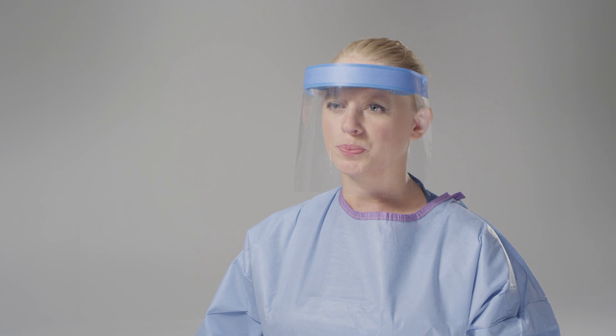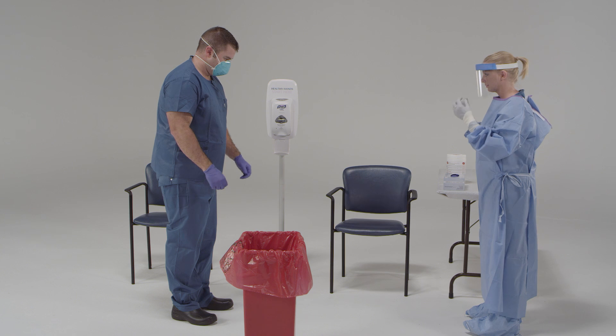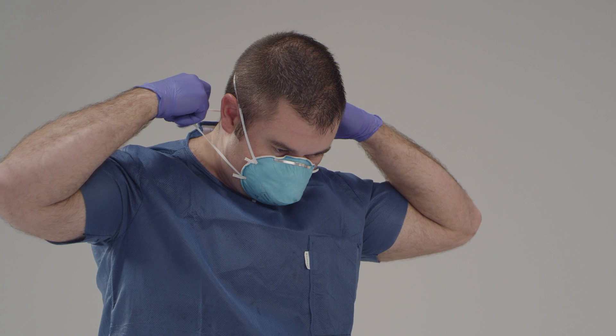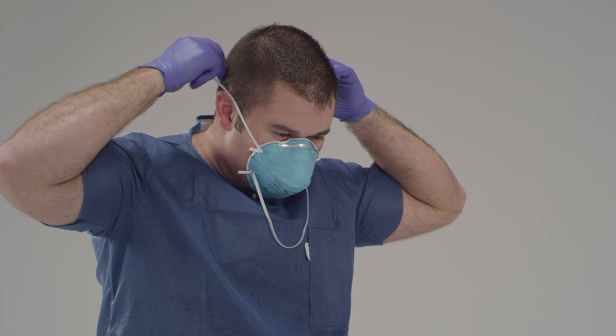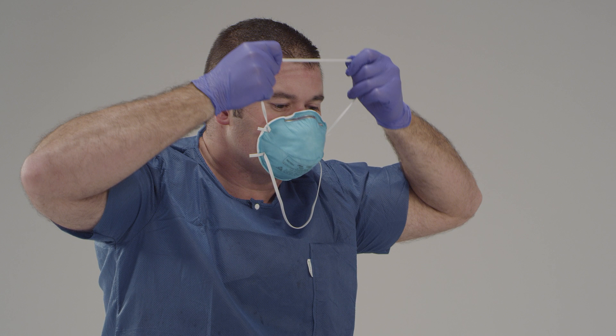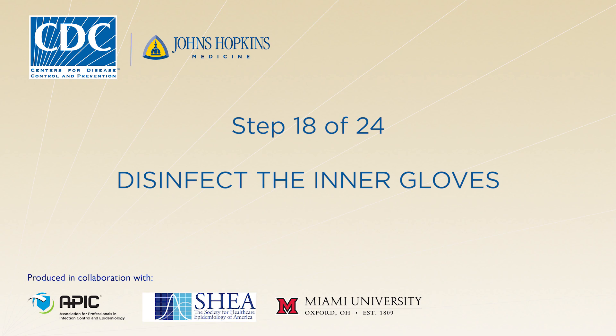Now you're going to remove your respirator. It's important that you not touch the front of the respirator. First, tilt your head forward, then use two hands to grab the bottom strap. Pull to the sides, then over your head. Next, use both hands to grab the upper strap, pull to the sides, then over your head. Keep tension on the upper strap as you remove it, which will let the mask fall forward. Dispose of it. We're getting near the end — you're doing great. Now disinfect your gloves.